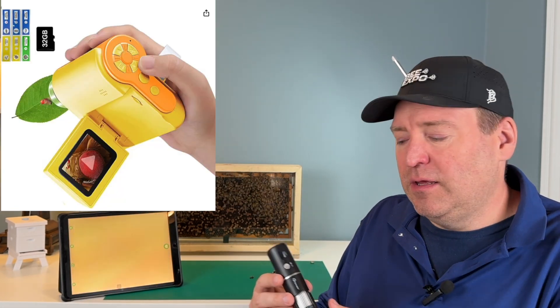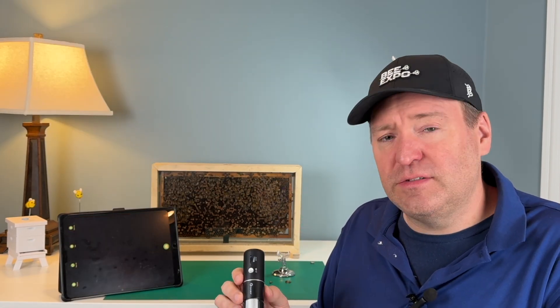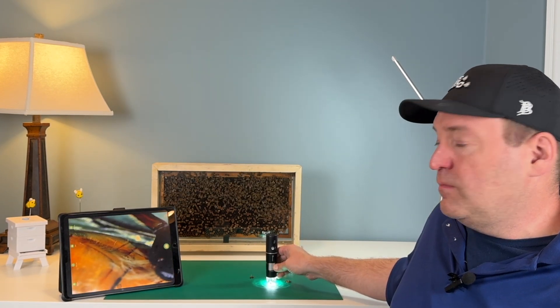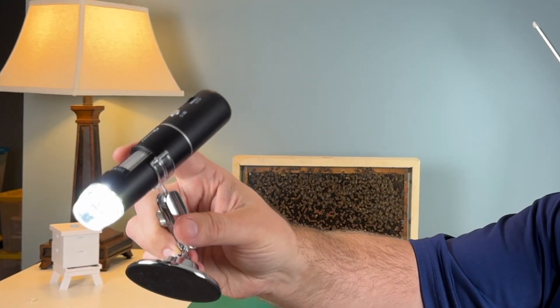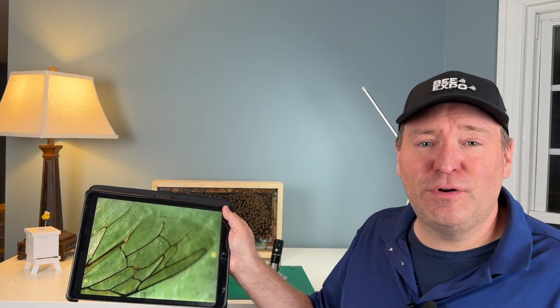A lot of them are made for children but they still have the 1000x magnification like this one does, which is hugely important. They all have a scroll wheel which you're able to use to focus in on the areas you want to see. They have an adjustable LED, which is a nice feature. I can also record video to show, for example, to my state inspector in order to identify what the problem is. And it comes with a nice stand that lets you set it up hands-free so you can just focus on the image itself.